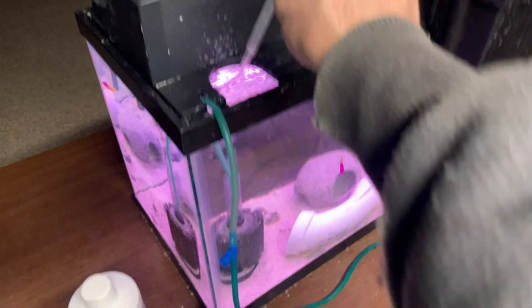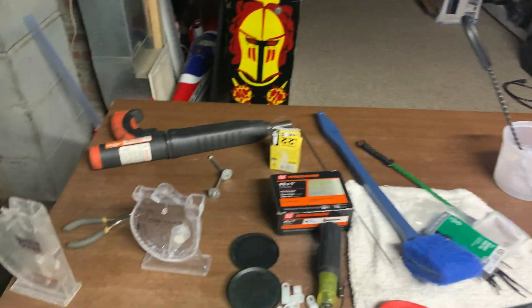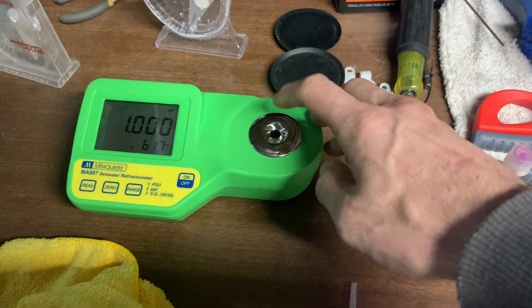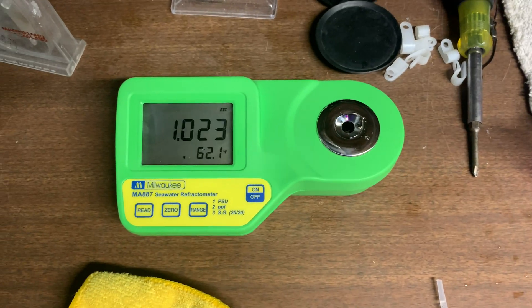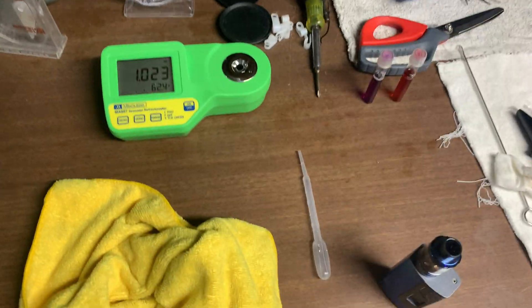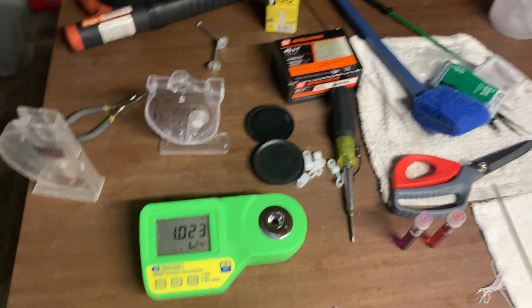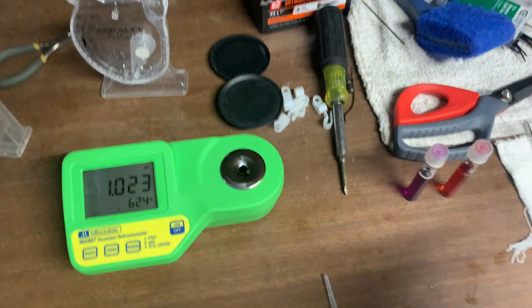And then you can come over here, take your water from in there. Now let's see what we get. 1.023. See, no difference. So I'm on like four or five days of no calibration — I just did that calibration just to show you guys. But that's it. Now what I can tell you is this thing is accurate, but it does bounce a little.